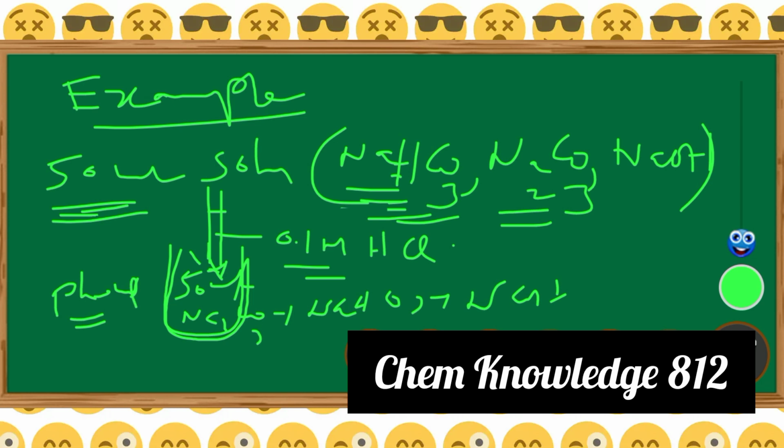Phenolphthalein indicator will be added, a few drops, and then we will start titration of this sample with the 0.1 molar HCl. So in this 50 ml we add just 3 ml of DMW. It will be better. So titration will be started with 0.1 molar HCl. After adding the HCl, we will get to the first EP.